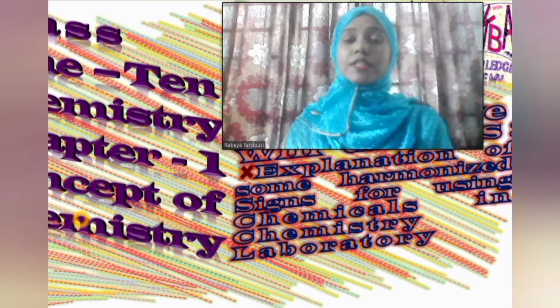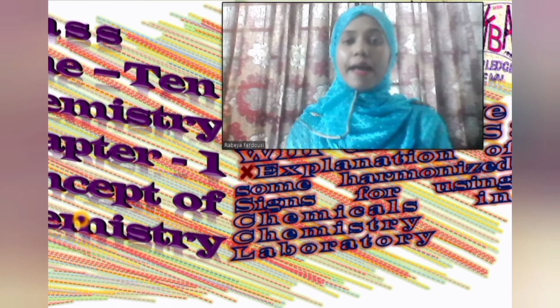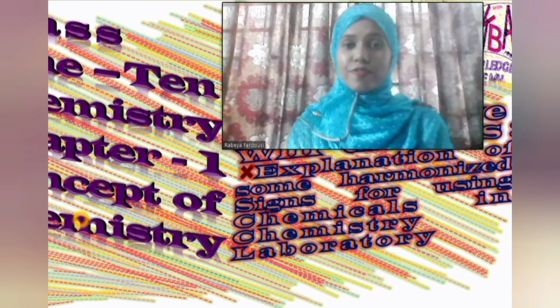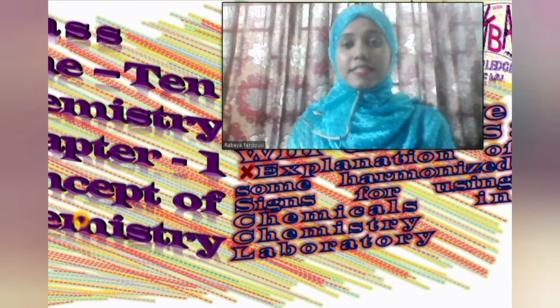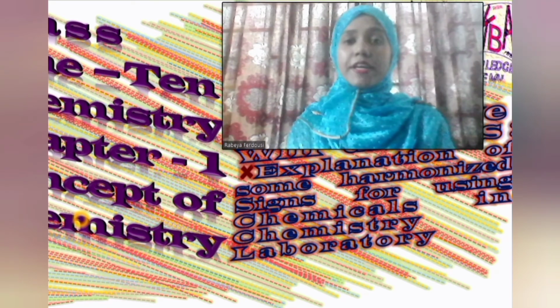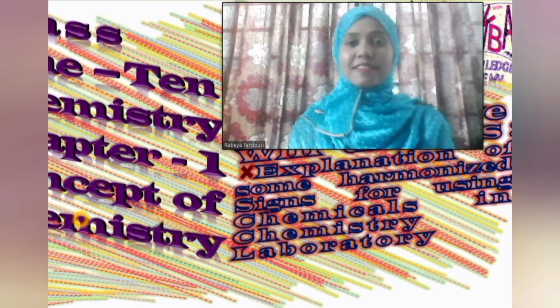In my today's video, I will discuss with you some harmonized signs of chemistry laboratory with their figures and explanations, obviously. And besides this, we will also know about the definition of laboratory and some safety measures for being cautious in chemistry laboratory. So let's get started.